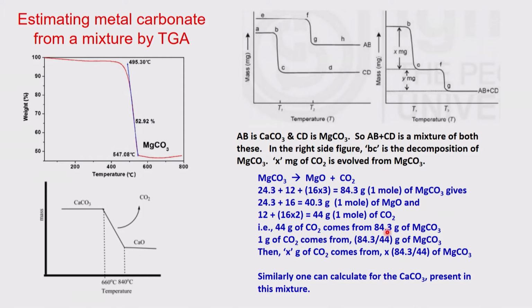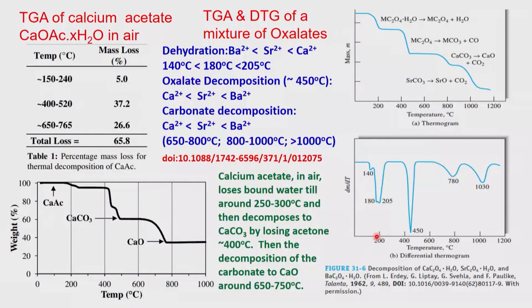Same thing is true with all the carbonates. So, therefore, you can easily get how much of that. So, you can find X, you can find Y in the mixture. I hope that is clear. Same thing is true even in the previous example which I talked to you about. You can get from here, and if it is not resolved, you can get from here, and you can resolve and find out too. Here it is a little bit of difficulty, but if you go to an experiment where you do it with a slow rate of change of temperature, you can get much better.